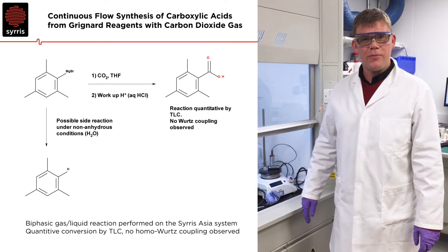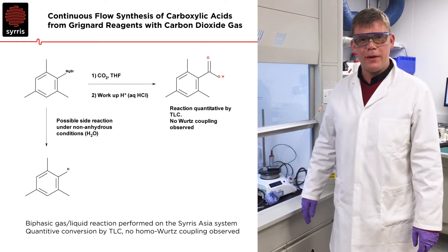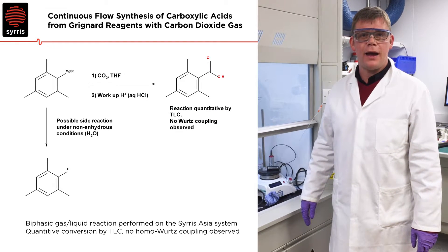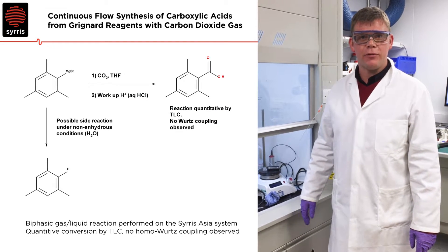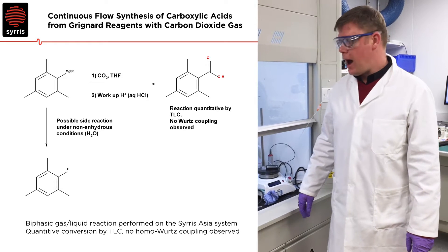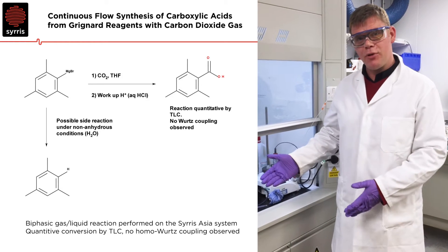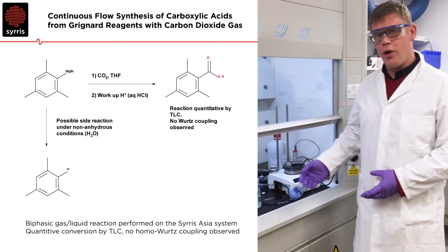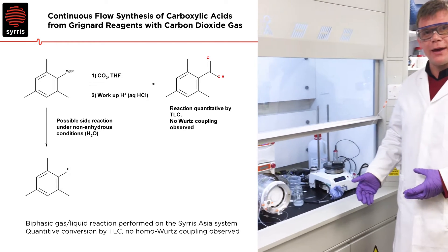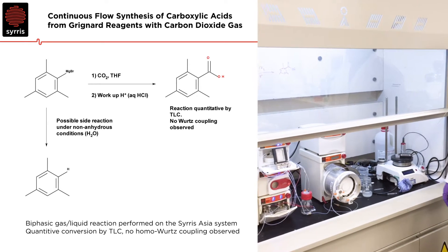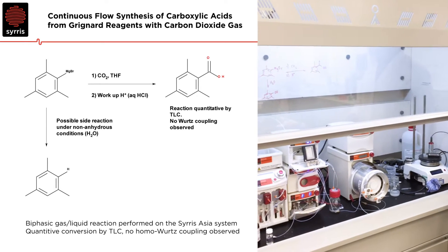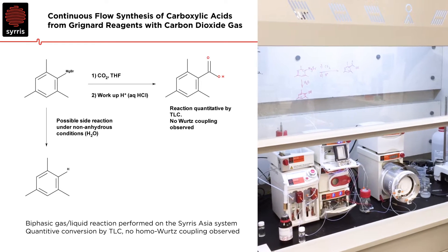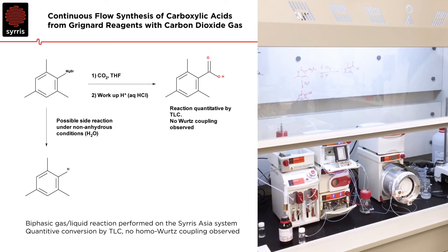Hello, my name is Andrew Mansfield. I'm the product manager for the Asia product range. I'm just going to demonstrate an example of introducing reagent gases through a glass micro-reactor chip on the Asia system.